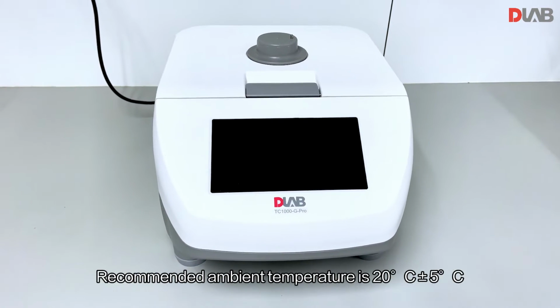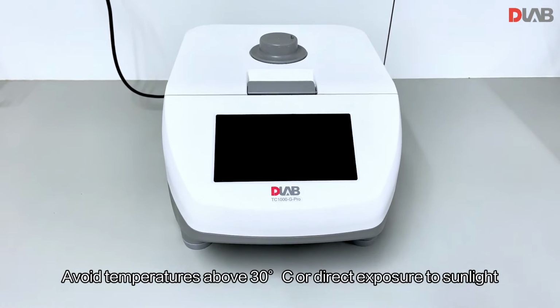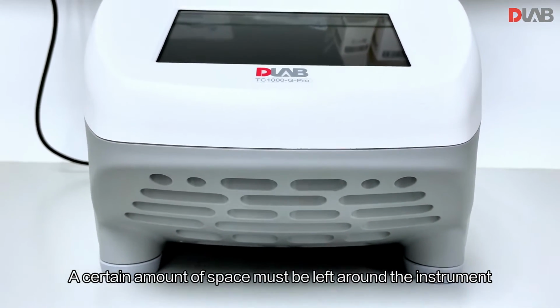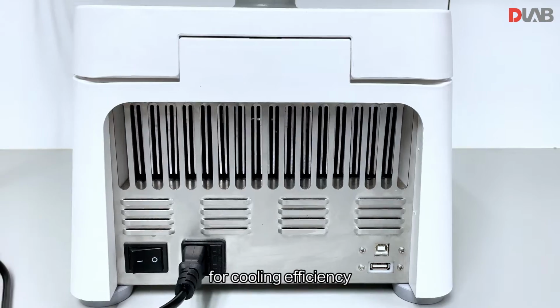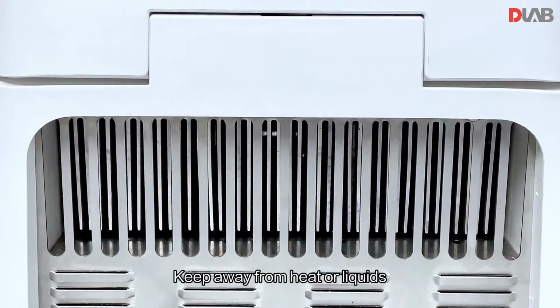Recommended ambient temperature is 20 degrees Celsius. Avoid temperatures above 30 degrees Celsius or direct exposure to sunlight. A certain amount of space must be left around the instrument, at least 10 centimeters on either side, and at least 30 centimeters behind for cooling efficiency. Keep away from heat or liquids.